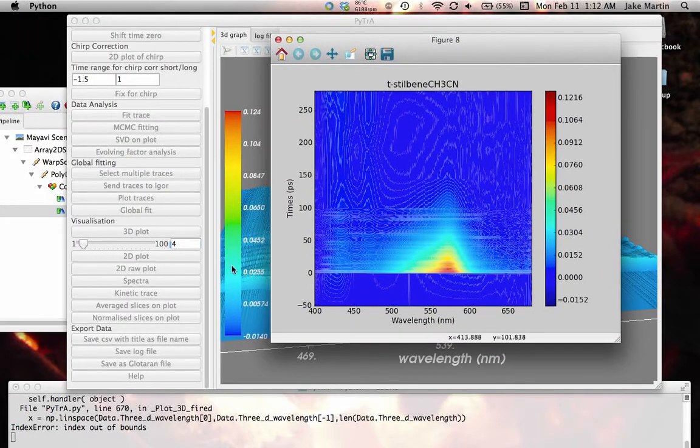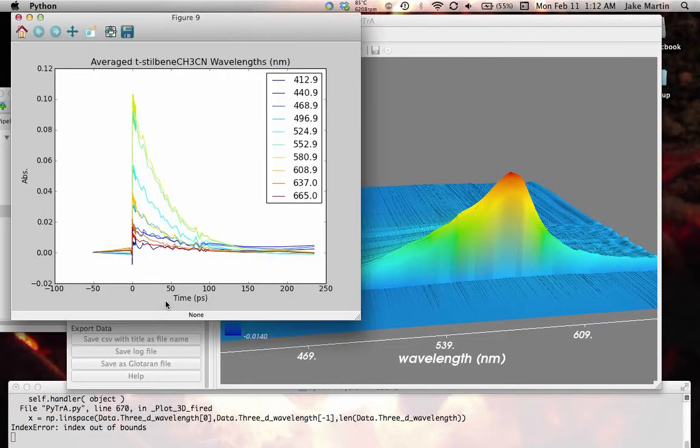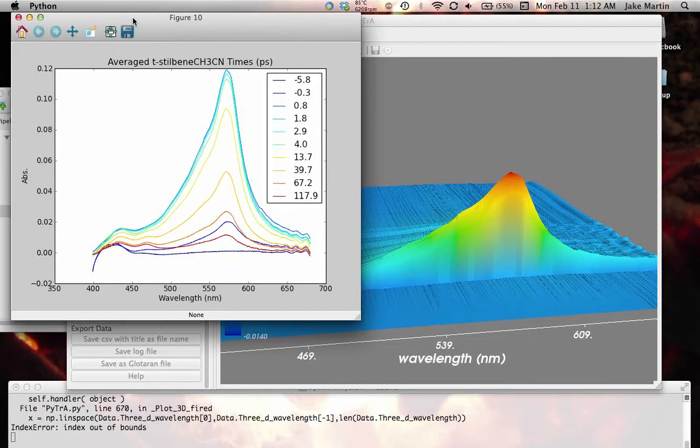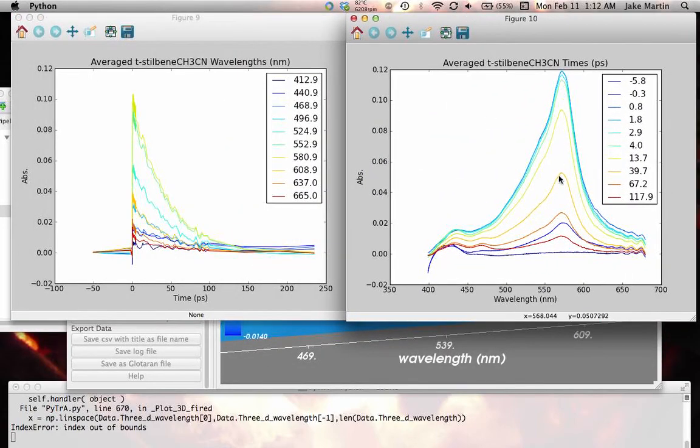On a contour plot, it takes the data from there initially. So if I want to do average slices on that contour which I just had up, it's going to take 10 sections and it's going to do averages, and you can see nicely how that comes down. And in the next version I'm hoping to have a bit more control about how you take those slices and how they're viewed.